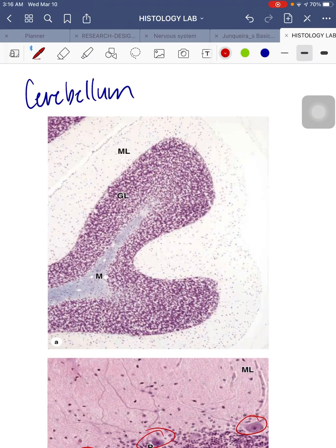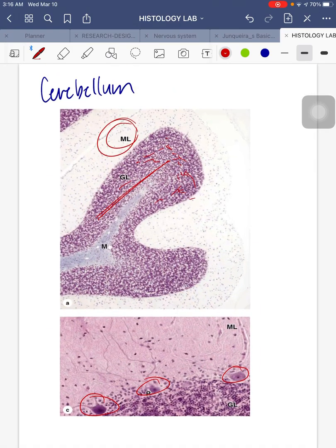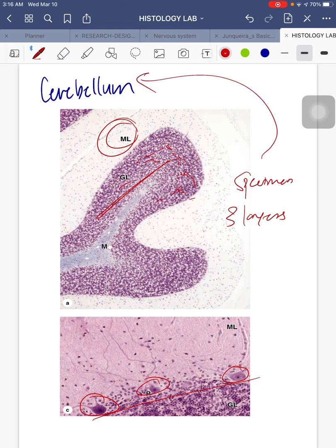Always make your answer complete: outer molecular layer, inner granular layer. If spinal cord had ependymal cells, cerebellum has Purkinje cells. The inner granular layer is inner and very dense with packed neuronal cell bodies, the outer molecular layer is smooth, and what is encircled in the image are your Purkinje cells. Remember the three layers, the specimen — cerebellum — and the special cell showcased, which is the Purkinje cell.